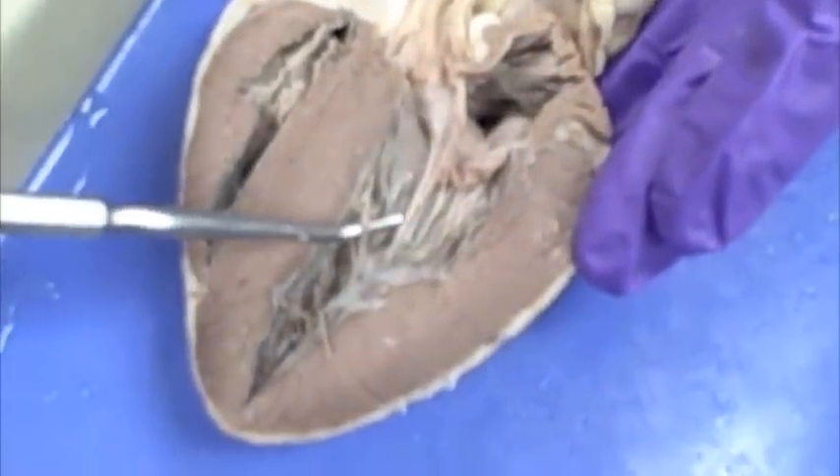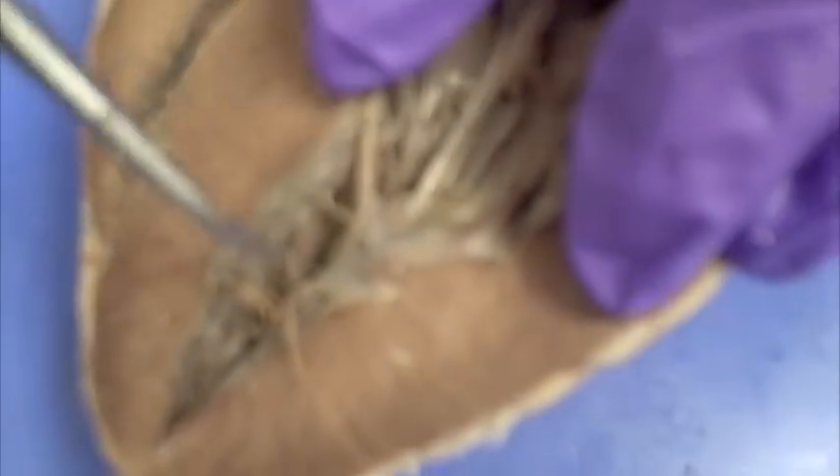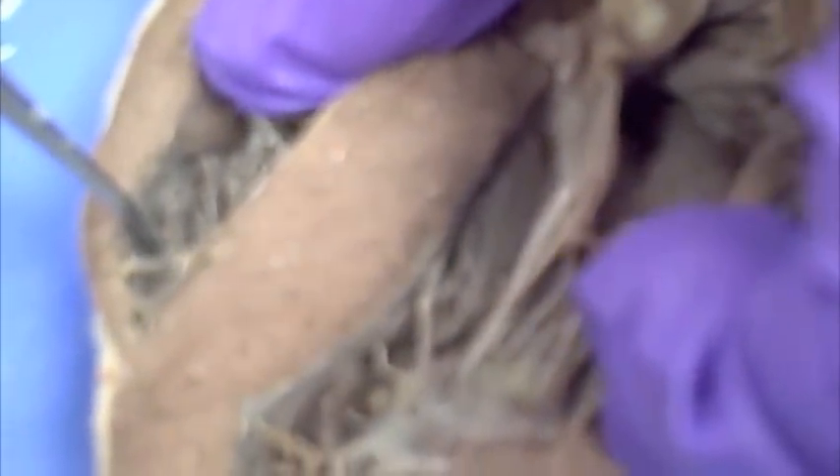You have to know the names chordae tendineae and papillary muscle. You have to know that the tip end down here is the apex of the heart. The ridges in the ventricles — you may not need to know this, but the ventricles have these ridges and they're called trabeculae carneae.